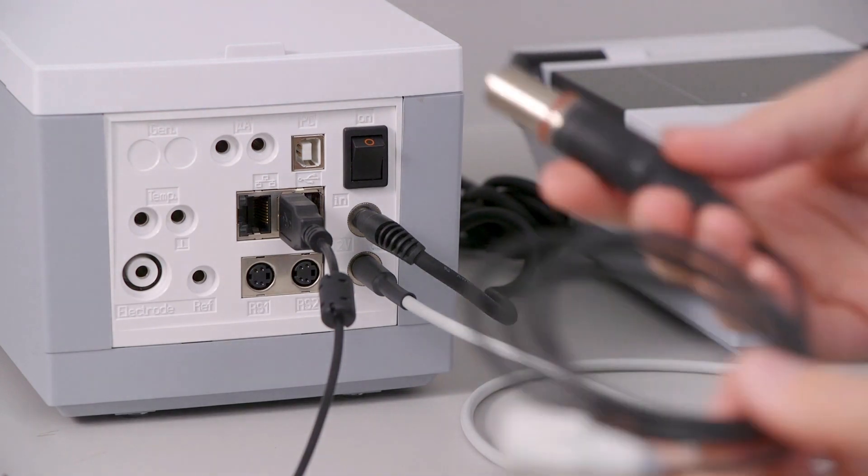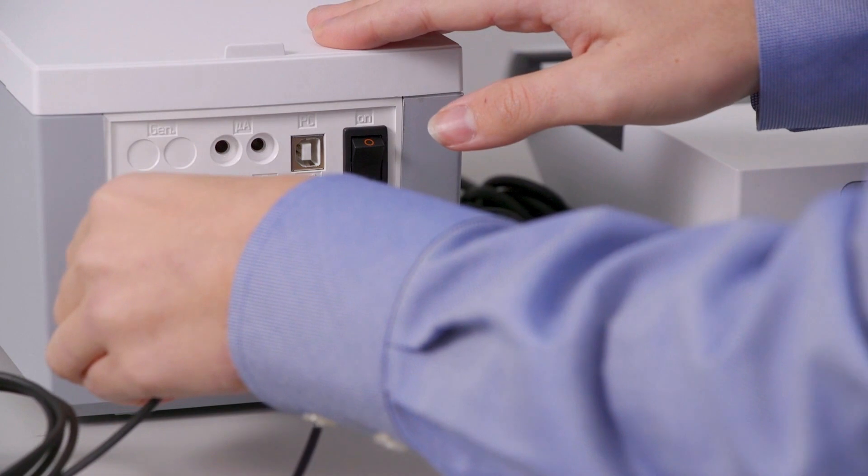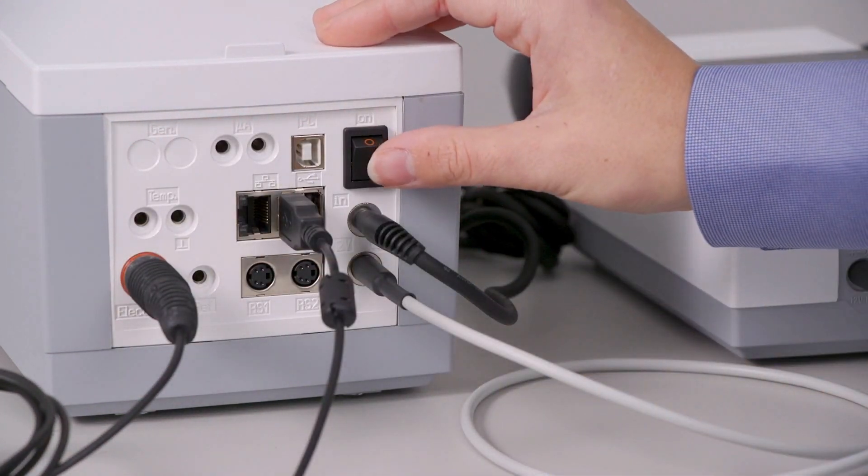The last thing to set up here is the electrode cable. So we'll just plug that into the DIN port on the bottom left hand side. Once that's done, you're ready to turn it on.